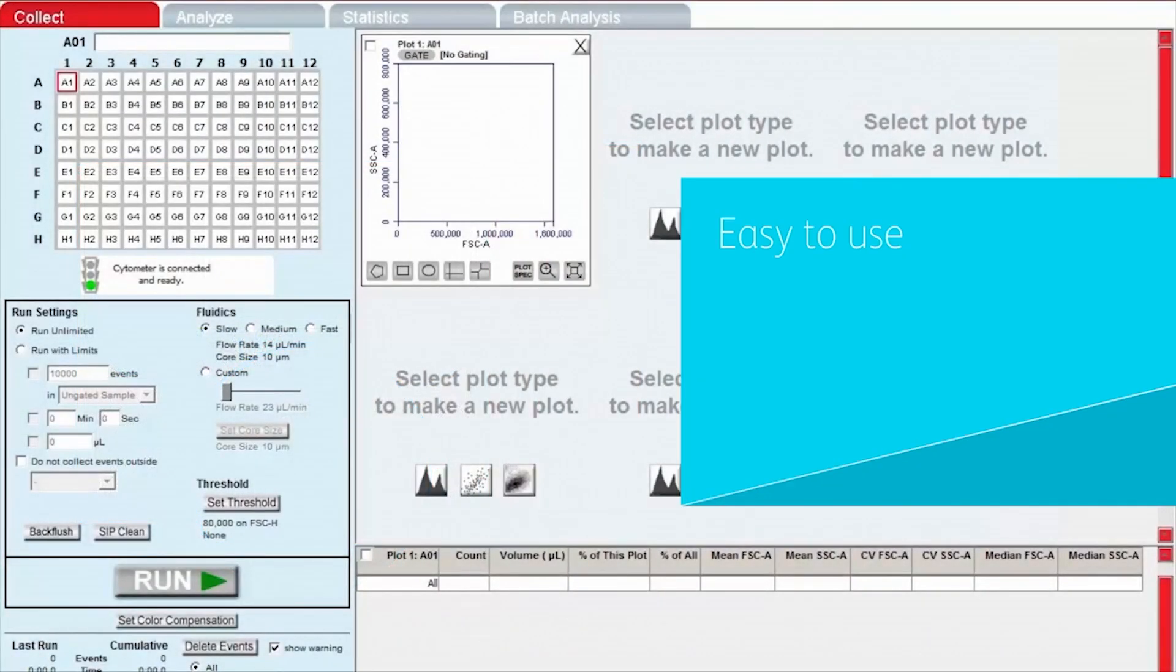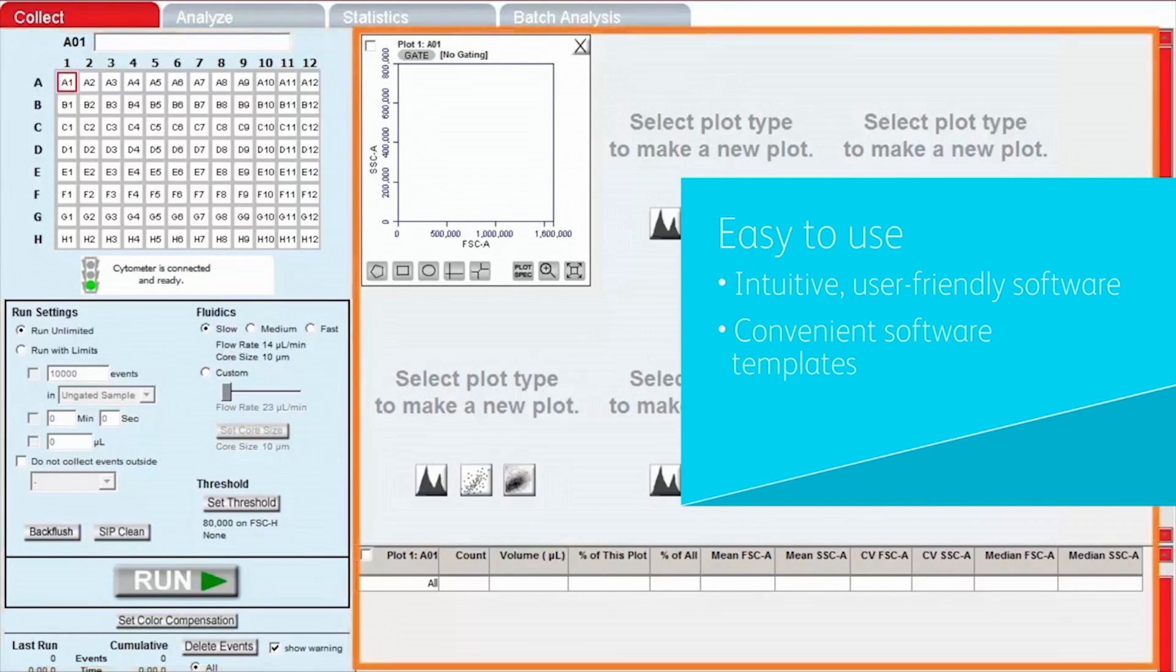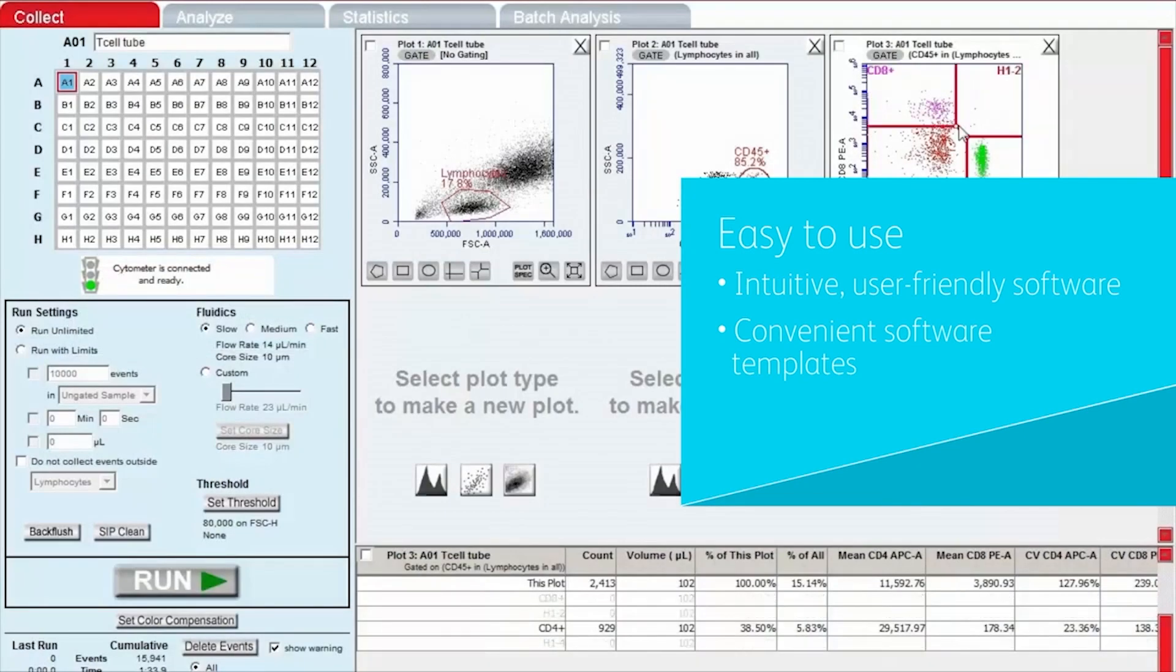The user-friendly software with automated functions is easy to learn and intuitive to use. With convenient software templates for over 30 applications, you can simply load and run your sample. The data shows up automatically in predefined workspaces, regions, and gates with compensation settings and labels, which can be exported in the format you prefer.